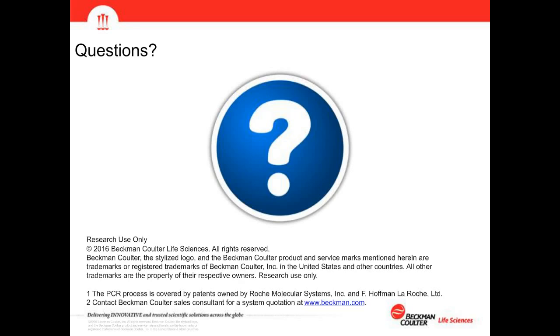And these pipetting templates are basically something a user can easily define just as writing a method, so it's icon-driven. And all operations that define the pipetting, like the move of the pipetting tip in the well, the actual pipetting speed, delays, etc., everything that you would automatically do manually, your brain adapts the pipetting operation to the pipetting context. All of that is in the pipetting template.